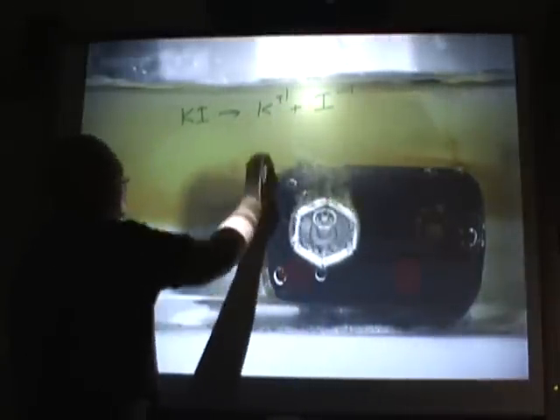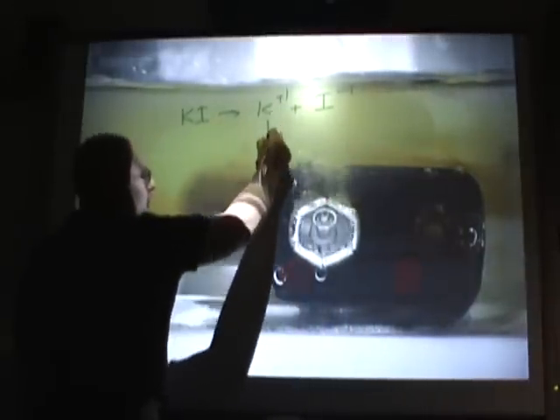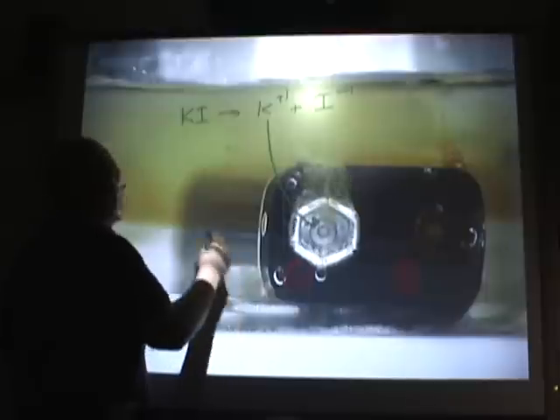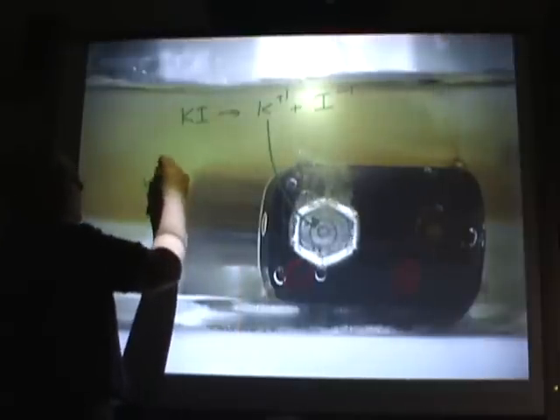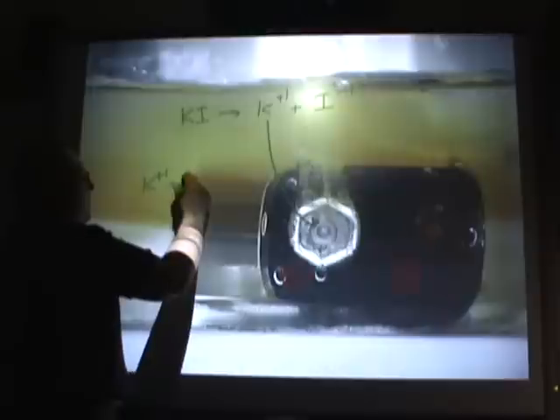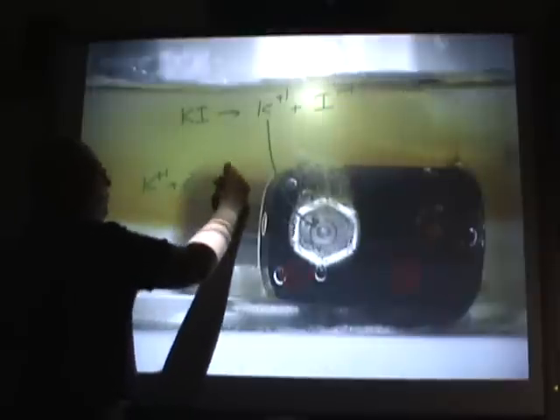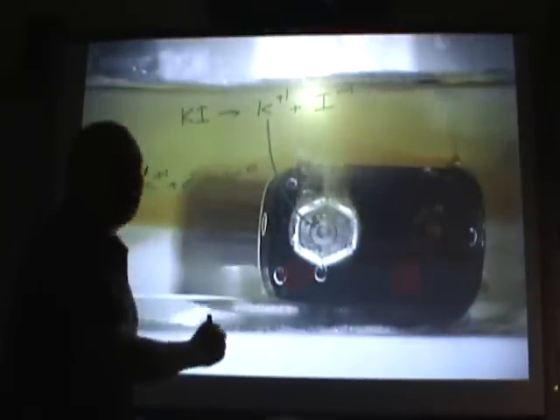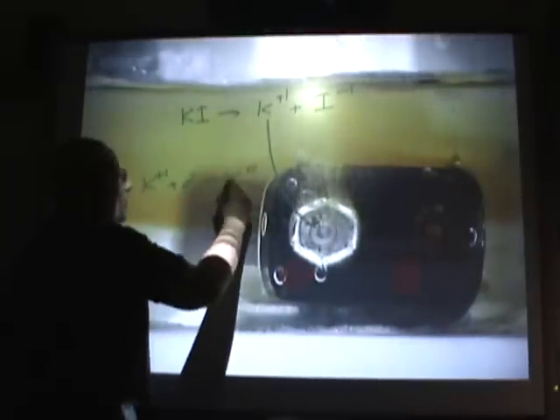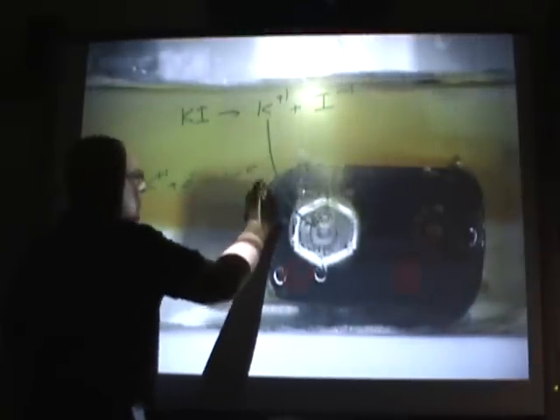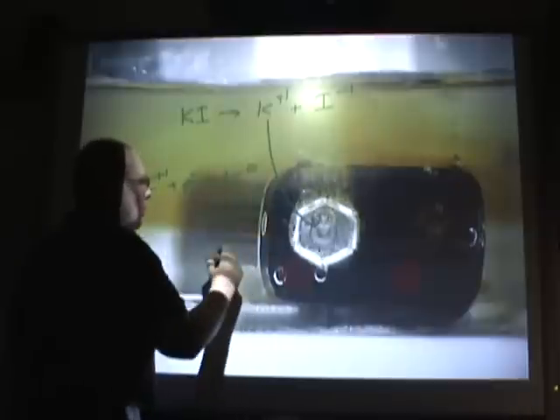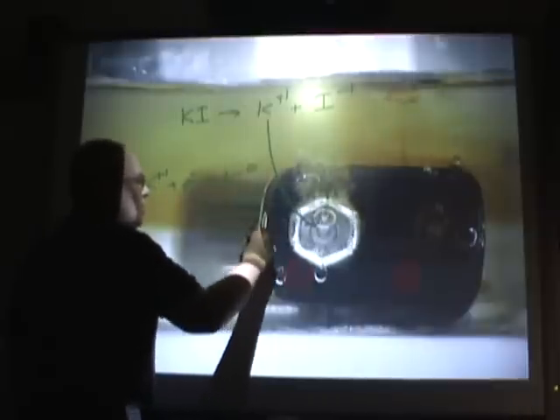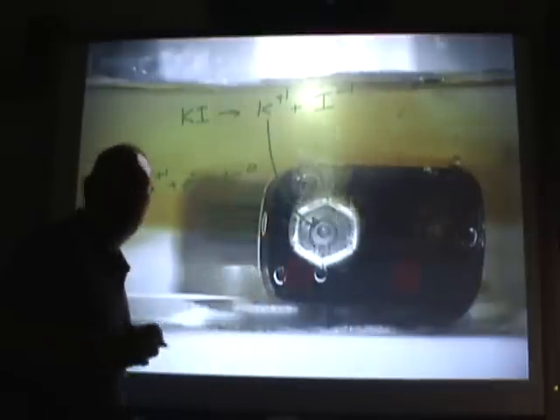So the potassium ions, just as before, get attracted to the negative electrode, where they pick up the electrons and form potassium, which immediately reacts with the water to form KOH, potassium hydroxide. We'll prove that in just a moment.